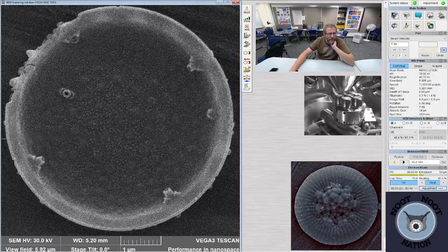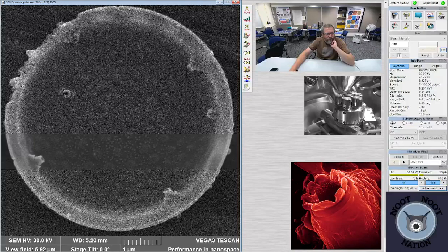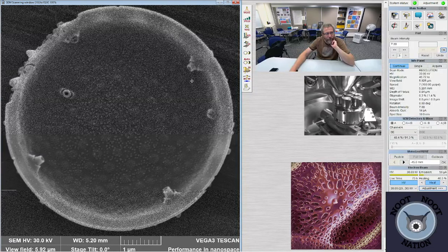this is just a little Steph as well. So the difference between Stephanodiscus and Cyclostephanus is they typically have sort of a chamber around the outside, and also the costae, which are a little bit more visible typically in Cyclostephanus, run all the way to the edge, but I don't even see costae on this one. So I think it's just a plain old Steph.